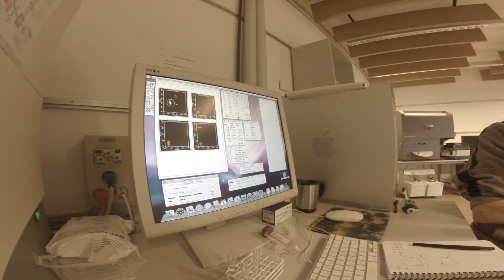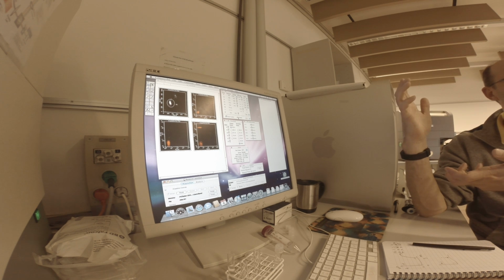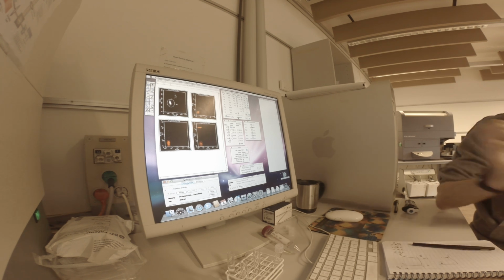We can't necessarily compare our experiments completely, because the differences could be big enough. I would score a population 1%, the neighbor would score it 1.5, right? So if I do a long-term experiment, it would be me running all the samples, not random people every time.